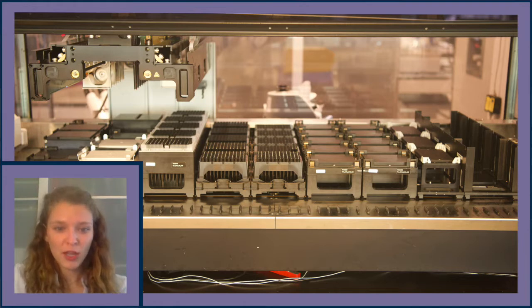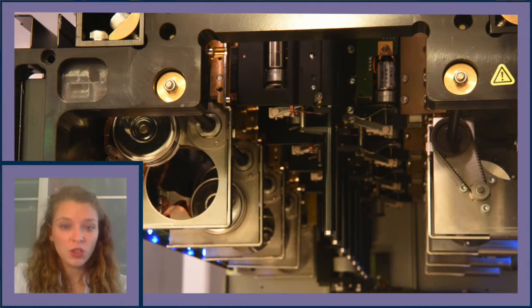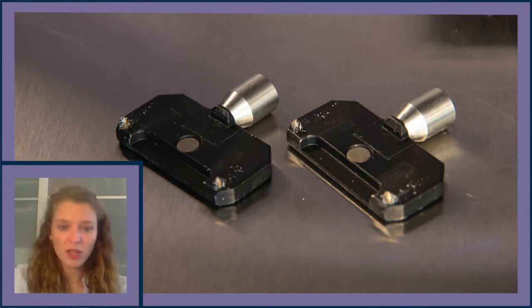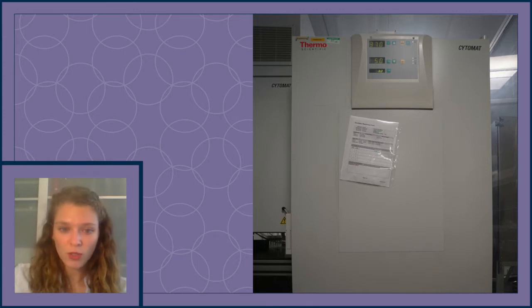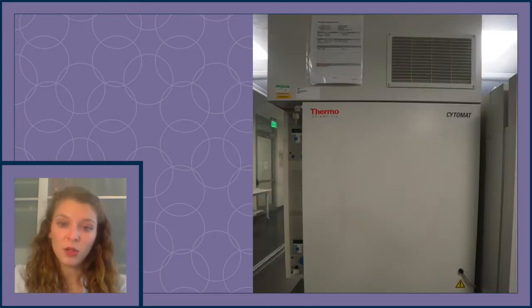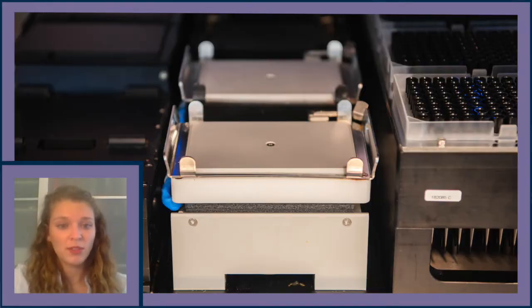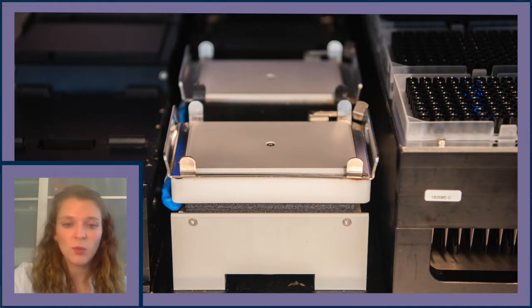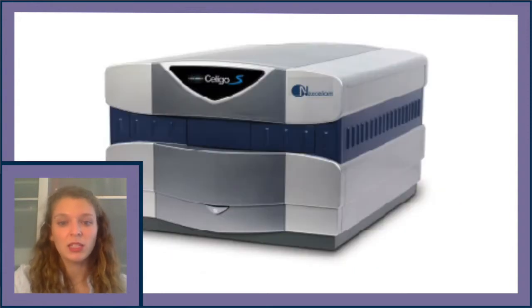Apart from our Hamilton Microlab Star Robotics platform, we have several crucial elements. The first is an eight-channel arm; two of these channels also work with core grippers to pick up and move reagents around the deck. We also have an iSwap for movement of components around the deck, an integrated Thermo Fisher Cytomat 24 (a 37°C incubator), a Thermo Fisher Cytomat 6002 (a 4°C refrigerator), both with plate shuttle systems, CPAC heating and cooling modules, tilt modules, an Agilent V-Spin centrifuge, and a Celigo Imaging Cytometer.